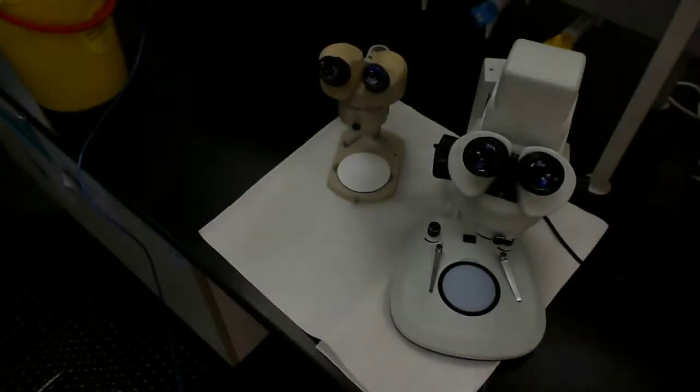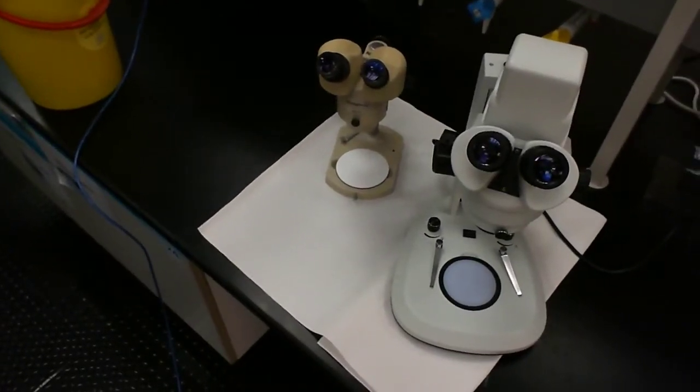Hi everyone, in this video we're going to be looking at the parts of a stereo microscope. Here we have two examples of stereo microscopes.